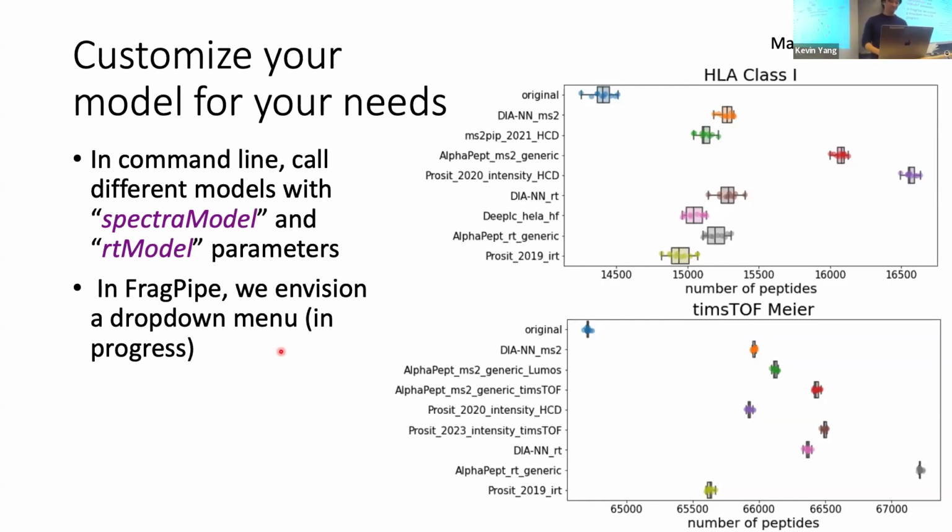That's a good idea. Now that you have these open data models trained, do you see that there's a dependence on the actual experimental platform that the data was generated on? So if you're testing it on one platform, but the data is collected on a different platform, that might be not as good as the same platform? Yeah, definitely. I don't think I included anything here, but for example, if you have different instruments, sometimes those spectra will differ greatly. And you'll actually be able to see it when you look at a PSM that has a really good database search score, but those intensities don't match up anymore.